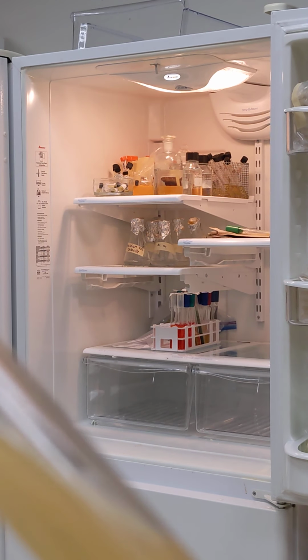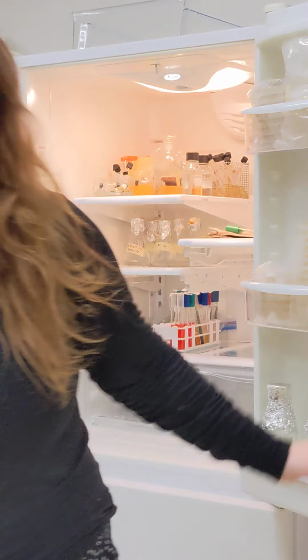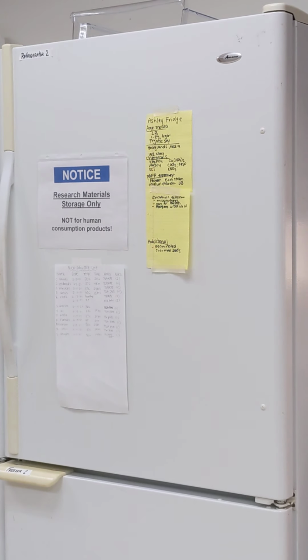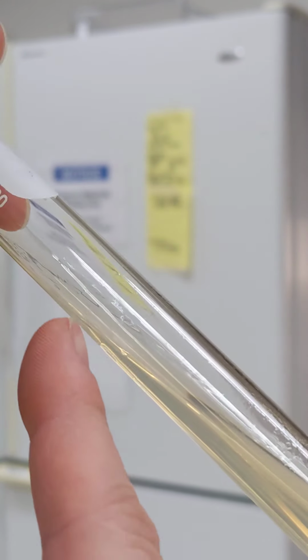And the last one that we sometimes use are called slants. I'm going to close this refrigerator. Give us some better background here. Slants can be kind of a narrow slant like that, or a really long, beautiful one like this. Notice it's really deep here on the one end and tapers as you move up through. So really nice if you want to culture something and then store it for a long period of time, particularly because they have some type of a cap on the top, so you're kind of sealing them up a little bit better.